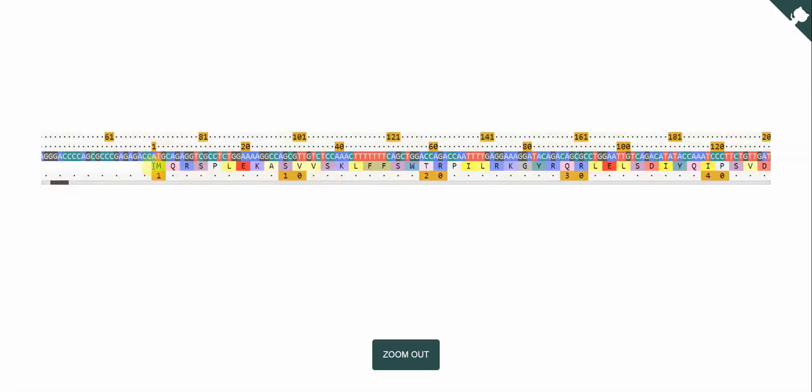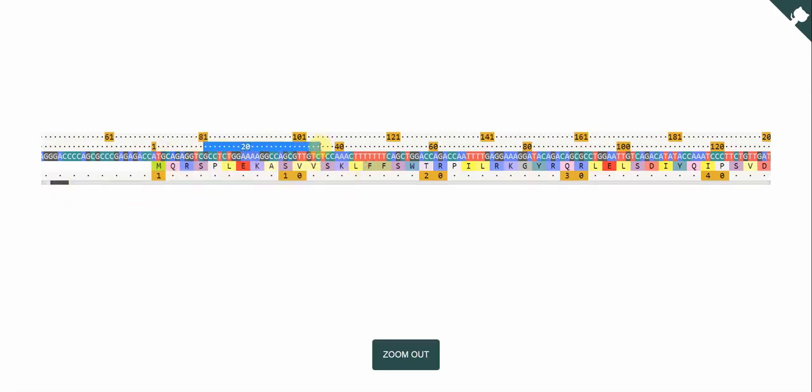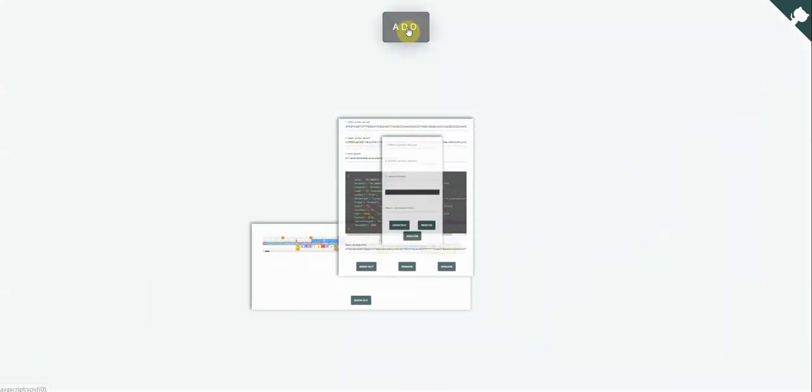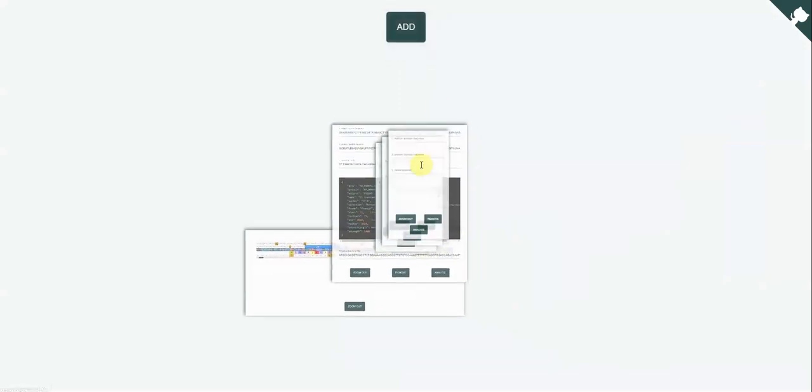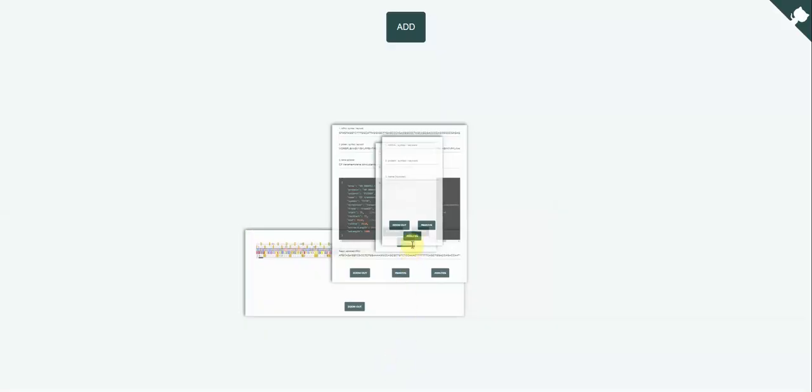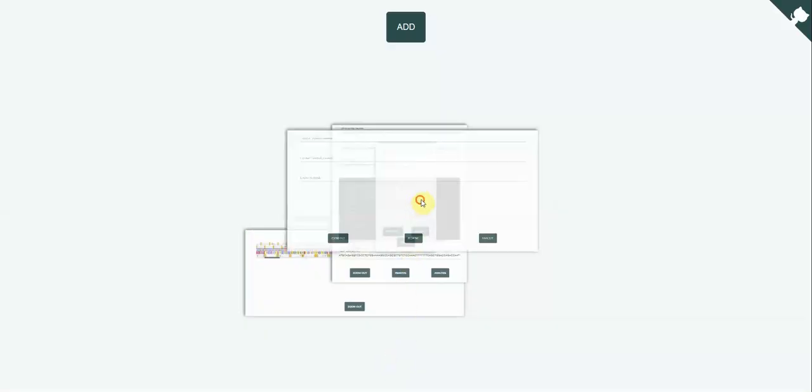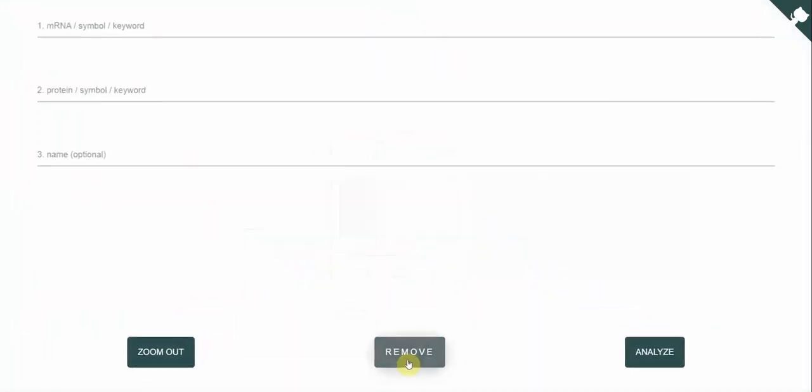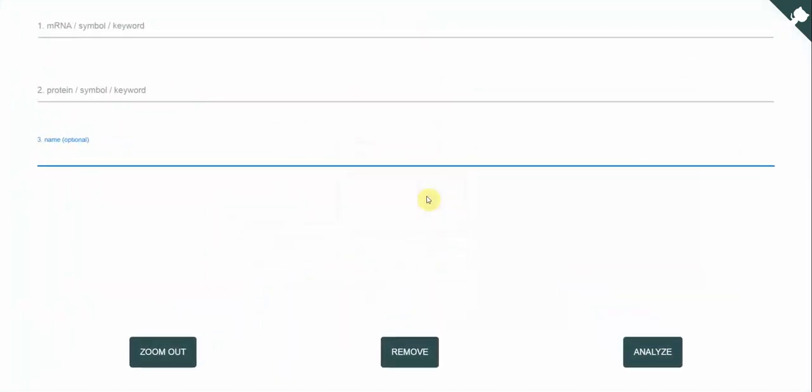So what it looks like is you have the protein sequence down here, the mRNA sequence and the respective numberings. What you can do is you can add more panels, you can add more sequences. I will remove these for now and I will just show you how you can also use it manually.